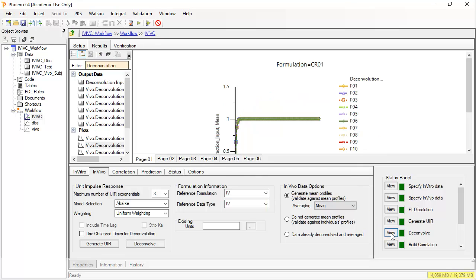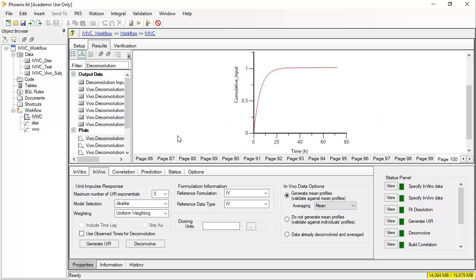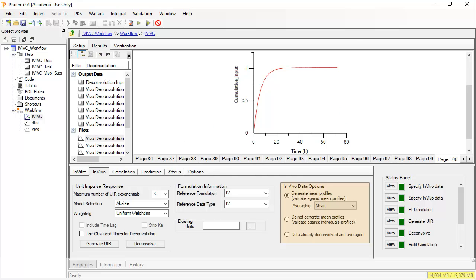Clicking on view deconvolve will change the filter in the results. See that only deconvolution objects are now listed. In this case, the dose was one, so the cumulative input and the fraction absorbed are both approximately one and therefore complete for all forms. The default of generate mean profiles is generally recommended if you have individual data. It will also execute faster.